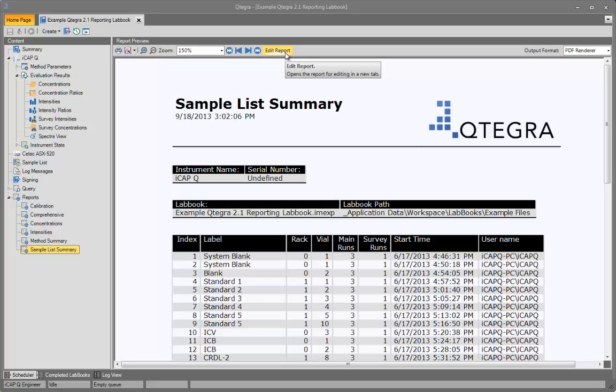OK, so those are the basics of working with reports in Qtegra. I hope you found this video useful.